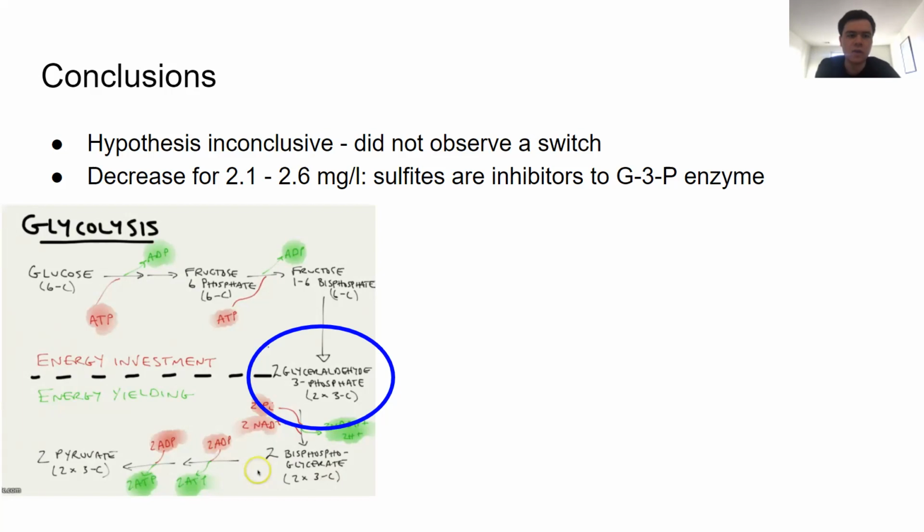Going forward, we would revise both our control level and the way in which we reduced the oxygen. Rather than using the natural level of dissolved oxygen in water as our control, we would probably start with a solution with the lowest amount of oxygen we could achieve to ensure that the yeast was not respiring aerobically to start. Then from this controlled baseline level, we would slowly increase the oxygen amount added in small increments in an attempt to locate at what concentration the switch from fermentation to respiration indeed occurs.